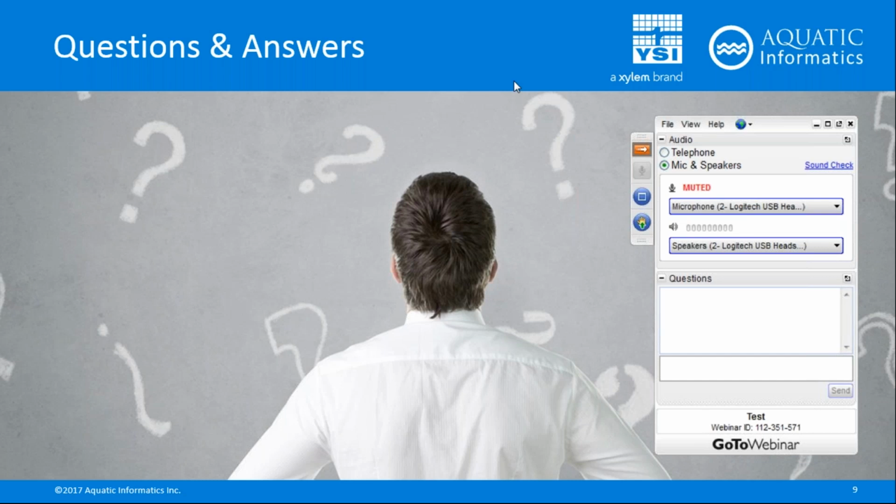Great. And another one was, and this is kind of general, but I think it speaks to some of the challenges we are trying to address with this webinar: can you talk more about how the YSI sensor information is translated into micrograms per liter? Could you just speak to that?